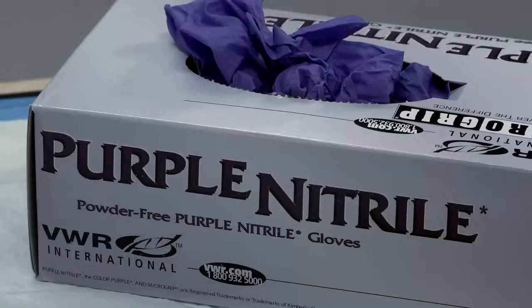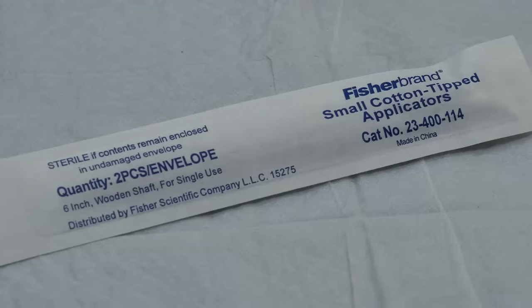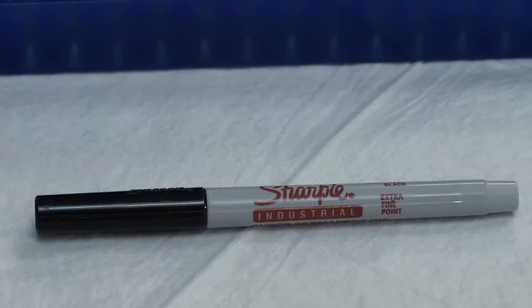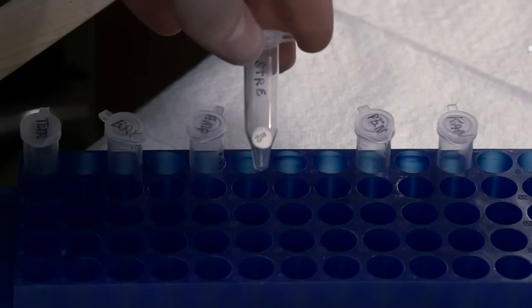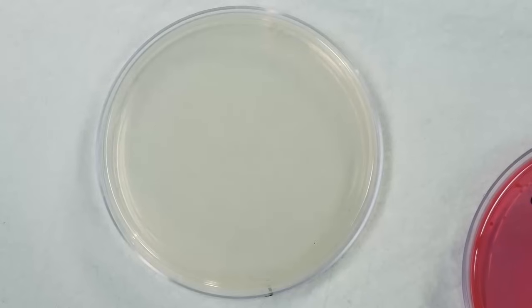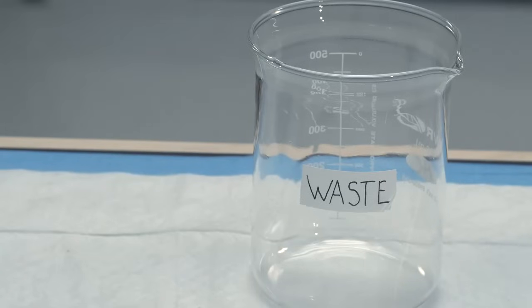To perform this experiment, you need gloves if provided, tweezers, sterile cotton swabs, a marker, six discs each pre-soaked with a different antibiotic, a plate with single colonies, a blank plate, and a container for waste.